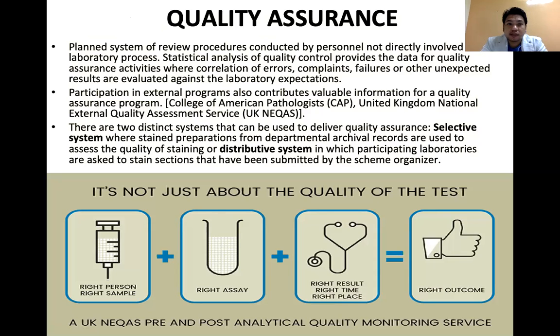So, it is a planned system of review procedures conducted by personnel not directly involved in the laboratory process. Statistical analysis of quality control provides the data for quality assurance activities, where correlations of errors, complaints, failures, or other unexpected results are evaluated against the laboratory expectations.